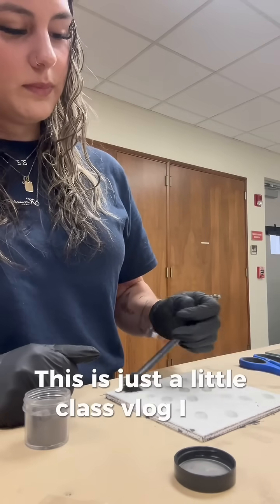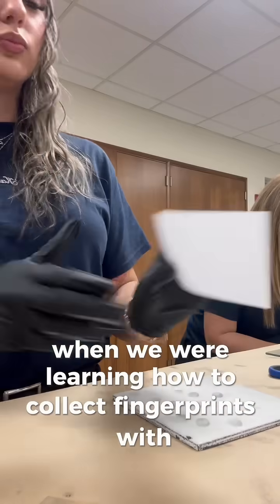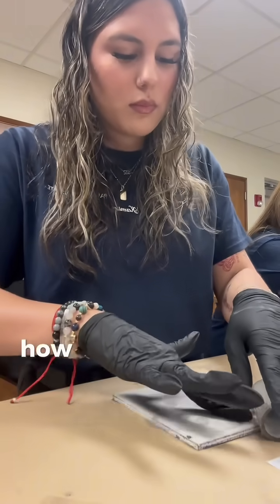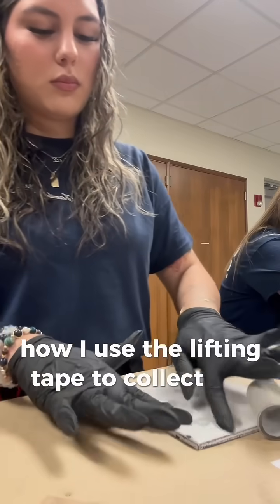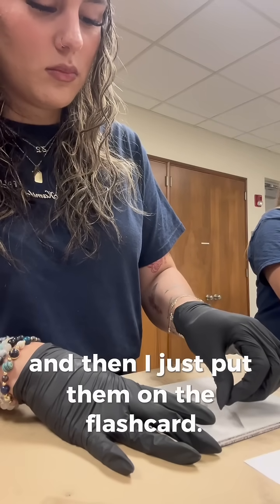This is just a little class vlog I did when we were learning how to collect fingerprints with black magnetic powder. Here I am just demonstrating how I used the lifting tape to collect the fingerprints that I wanted and then I just put them on the flash card.